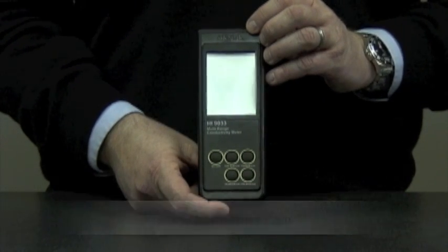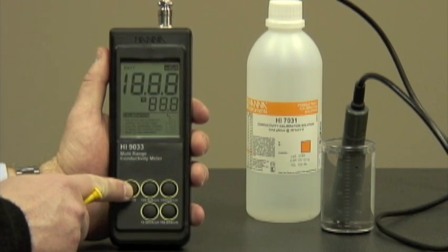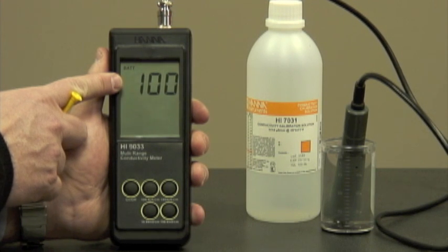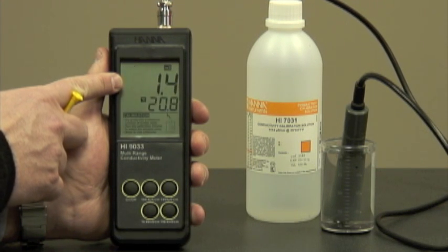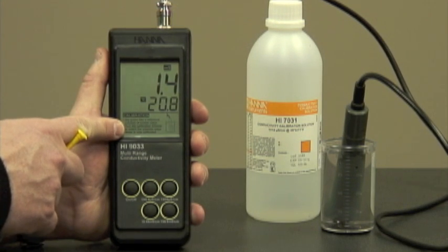Now let me show you how to calibrate the unit. I've inserted the batteries and attached the probe. We're going to turn the unit on. Immediately you'll see the battery percentage level, the conductivity reading, temperature, and some handy instructions at the bottom.